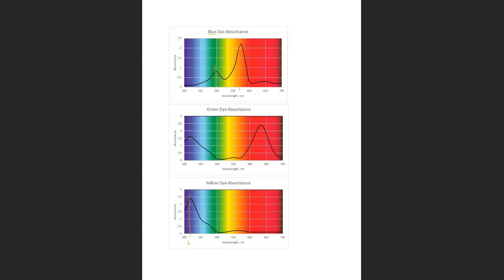And then as the last part, this is part 3, to conclude this report, they will ask you, what can you conclude about the colors that your eyes can perceive and the energy absorbed by the color solutions?